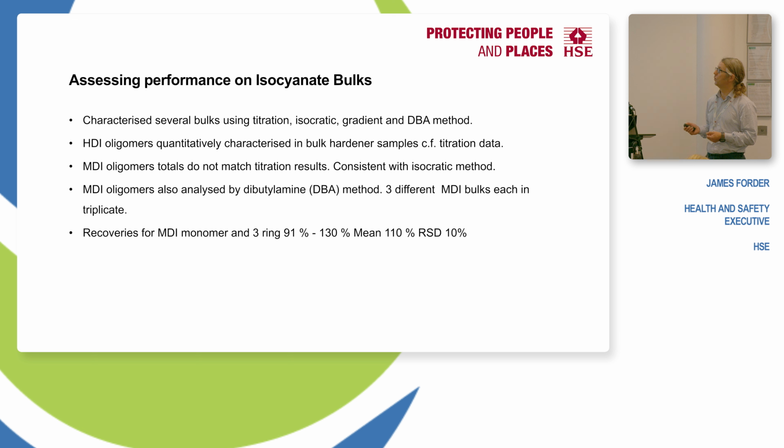consistent between all three HPLC results, the mean 91%, 130%, mean 110%. Reasonable relative standard deviation between dibutylamine and MDI. So, although you can't recover everything from the titration, all your methods are consistent. So the reason you can't recover is some of these MDI oligomers here.